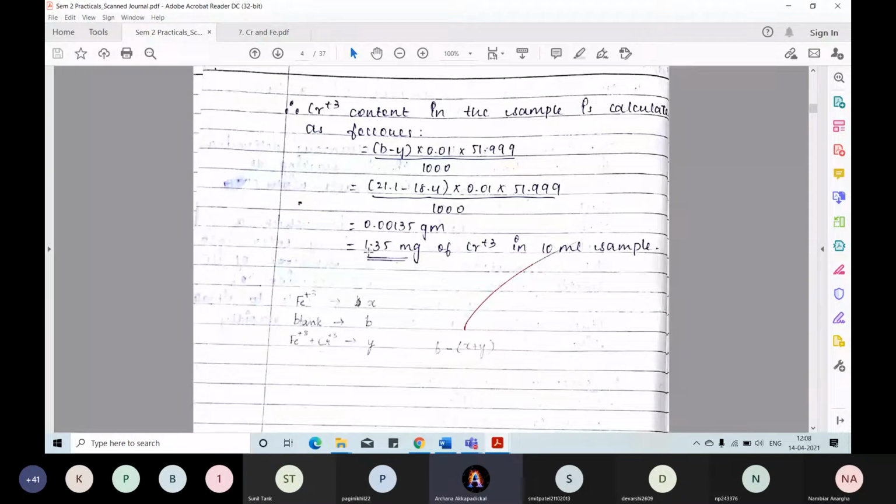Putting in the values and doing the calculation, you always do correctly. The mistake that students usually make is, you can see over here, the second last step is in gram. First, you have to look into your question paper whether it is asked in gram or milligram. First, you confirm the unit.